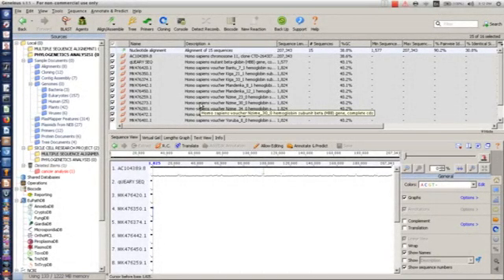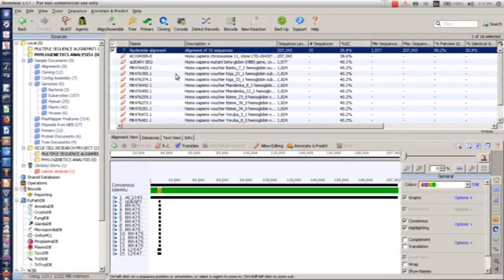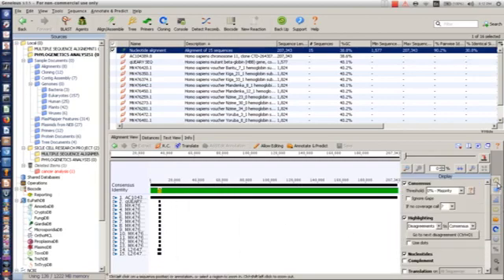Yeah, so the alignment has finished running. So here's the alignment. You'll find something like this, a nucleotide alignment on your system, which is an alignment of 15 sequences. This is the view of the alignment. We have all the graphs and displays, just like what we did the other time. And then we have the consensus, which I believe you understand.